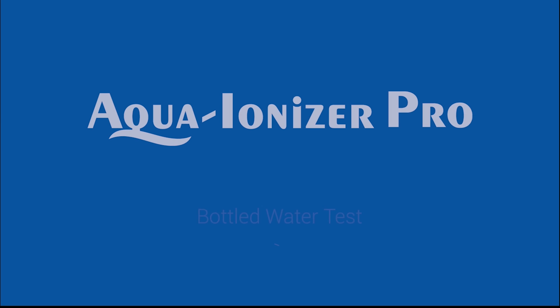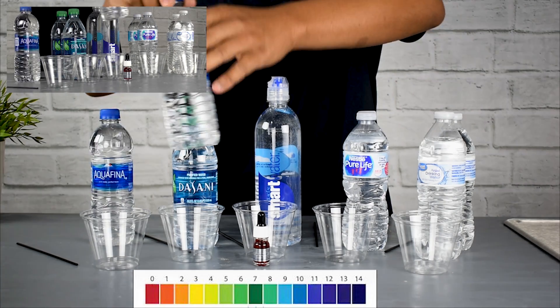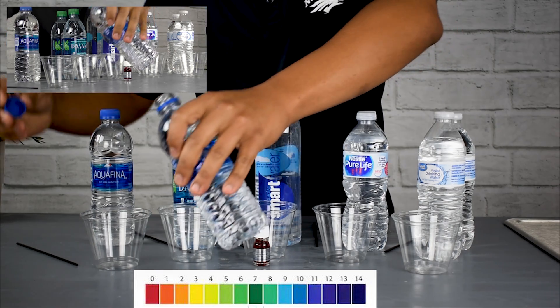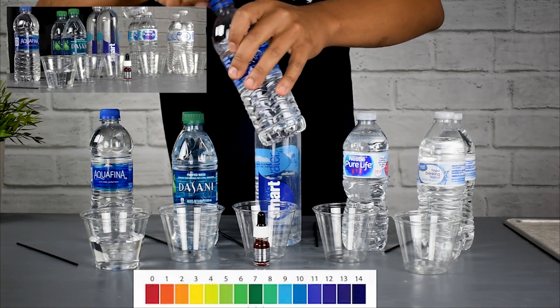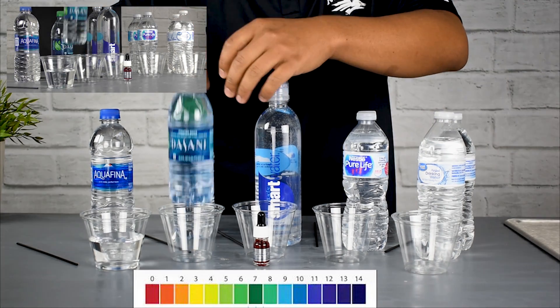Hey you guys, this is Aqua Ionizer Pro here. We wanted to do some pH testing of some of the major bottled waters. We have here Aquafina, Dasani, Smart Water, Nestle Pure Life, and the Great Value Walmart Purified Bottled Water.